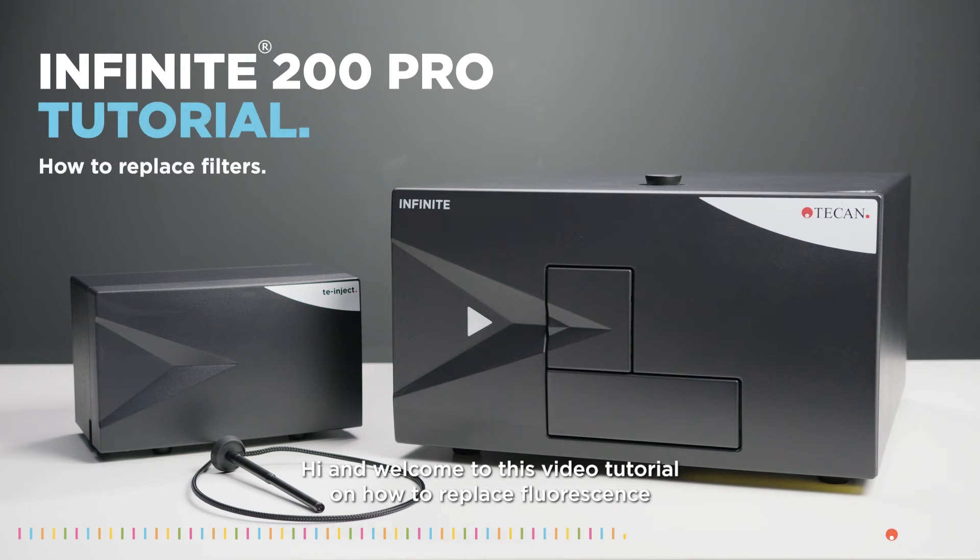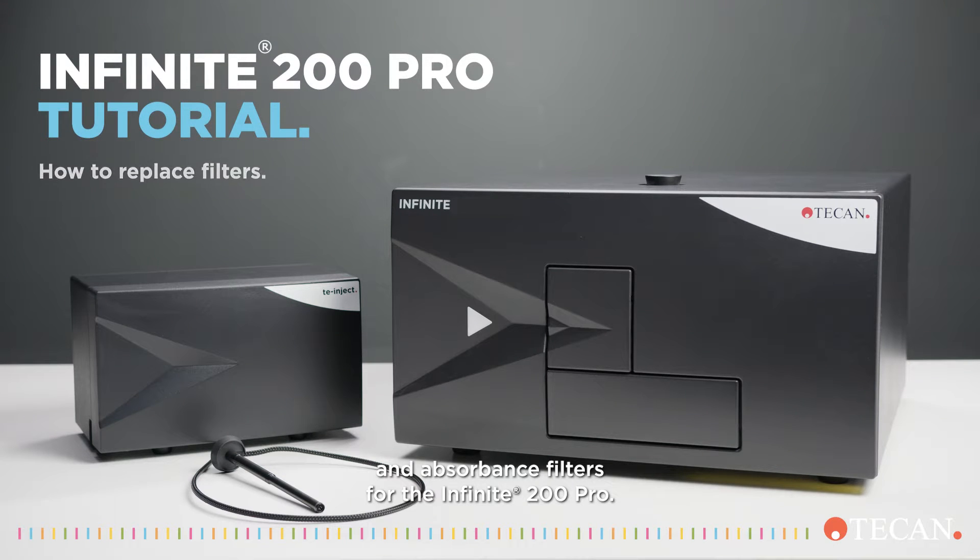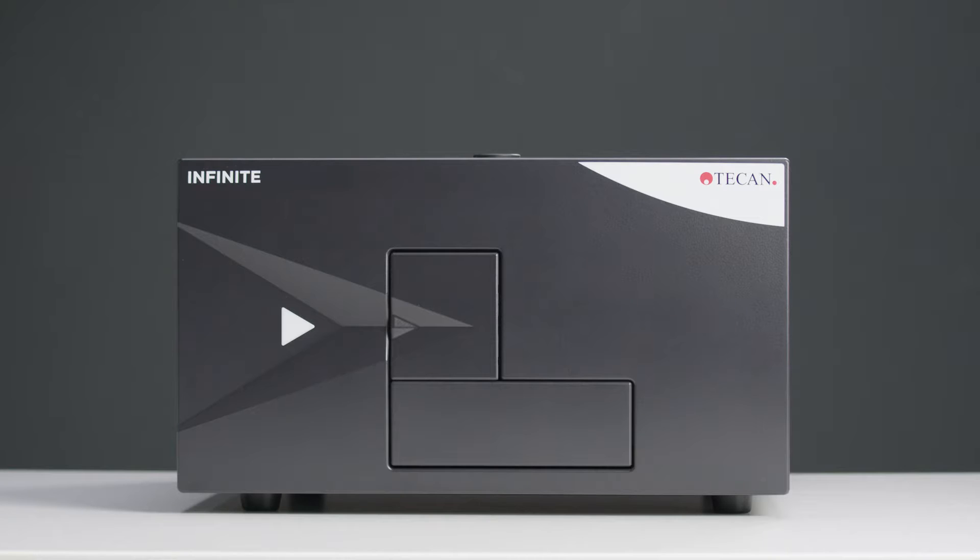Hi and welcome to this video tutorial on how to replace fluorescence and absorbance filters for the Infinity 200 Pro. The filter slide is positioned on the front side of the instrument, behind the filter door.